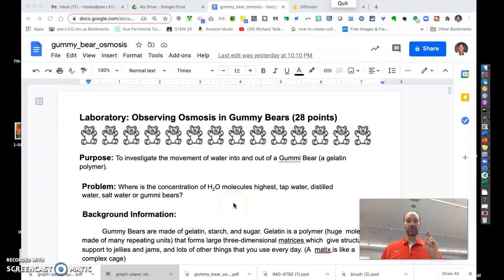Okay, so here's going to be our second video today. And our second video is just going to be going through the lab and how to fill this sheet out. And then when we come back, all right, so we have a class today, so I won't see you till Tuesday. I'll have the results for 3 days and I'll show you what happened.